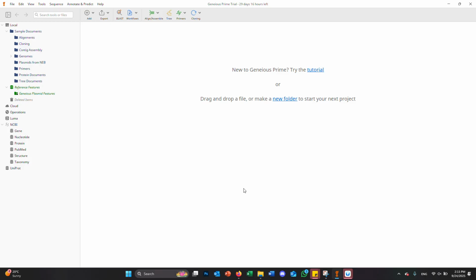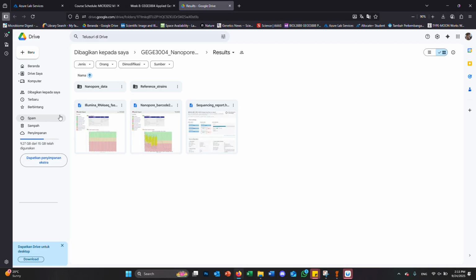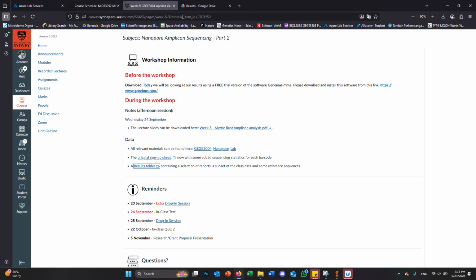Over time, those pores are getting depleted slowly as they do more sequencing. Some of them are just unavailable for a short while, being reloaded with a new fragment. And then there's some that just become inactive, and some that have zero activity. And this tends to increase over the duration of a run.